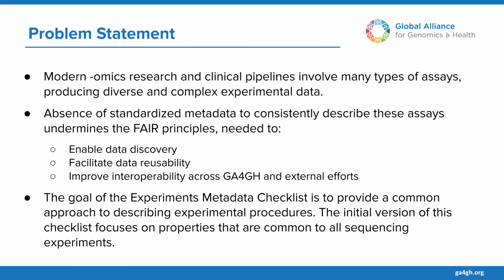So there's lots of pipelines, lots of projects, all producing multi-omics data using sequencing technologies like whole genome sequencing, RNA-seq, single cell, and then epigenetic assays with the methylome and the ChIP-seq, ATAC-seq, etc. All of these types of assays exist and produce data that's in essence very different from one data set to another.